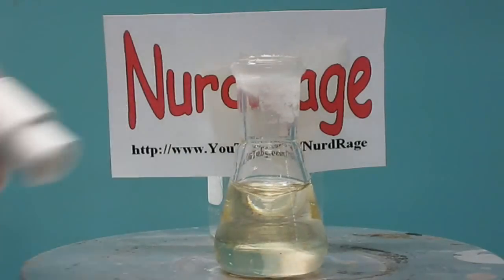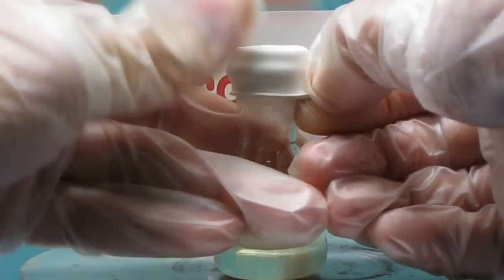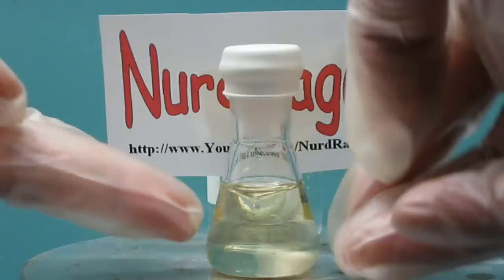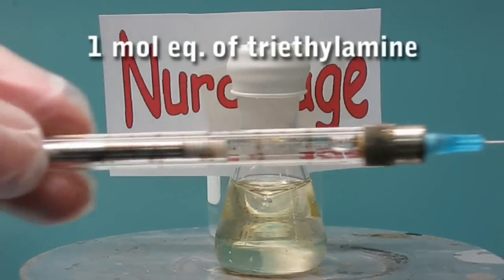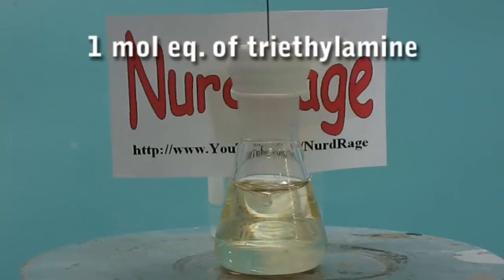At this point, I like to install a rubber septum onto the flask to prevent moisture from getting in during the cooling step, but this is optional. Now get a syringe and inject one mole equivalent of triethylamine. I'll leave the exact calculation to you as an exercise.